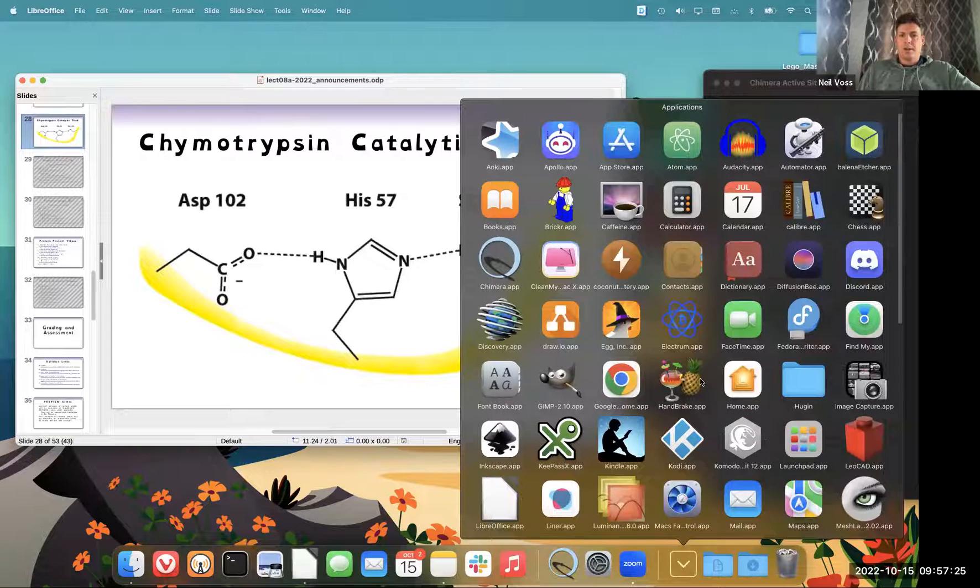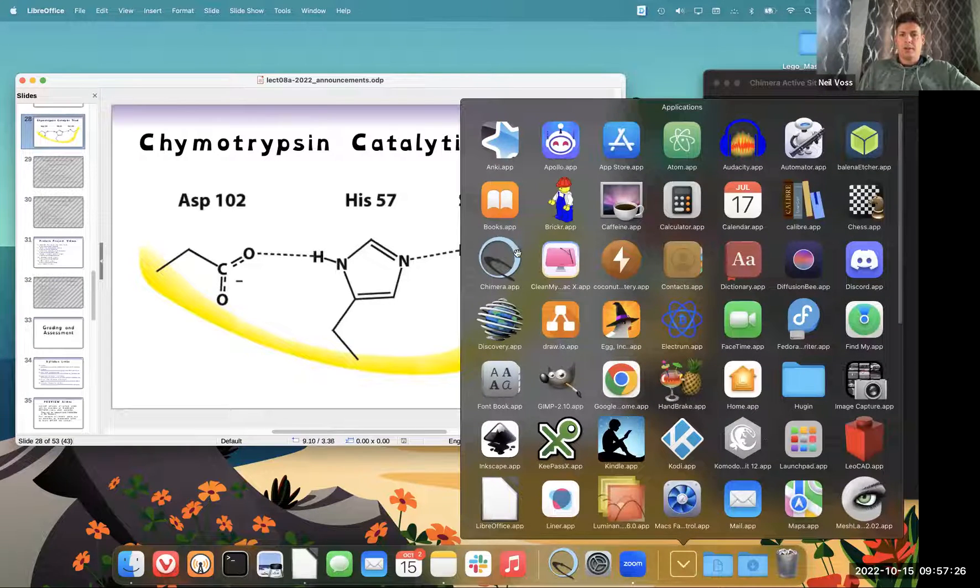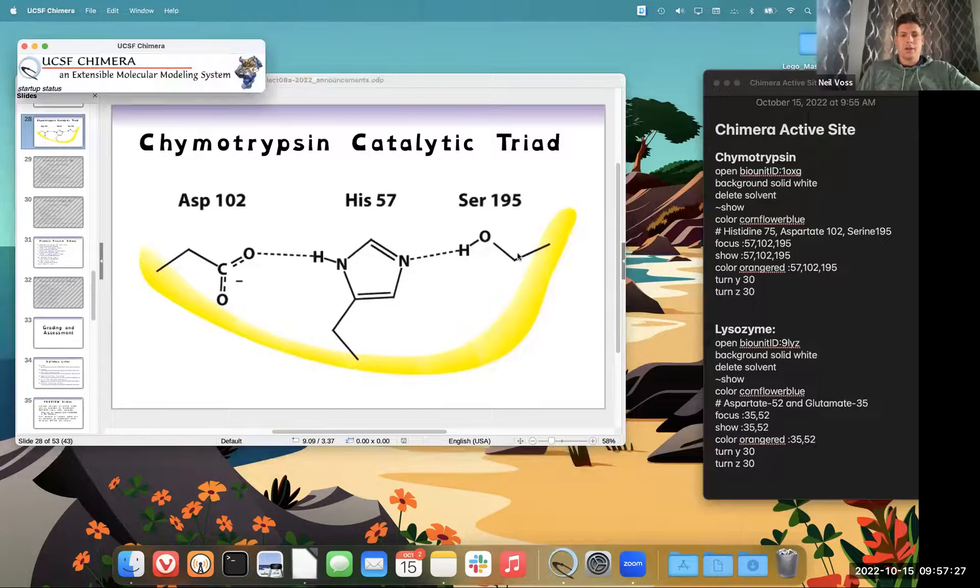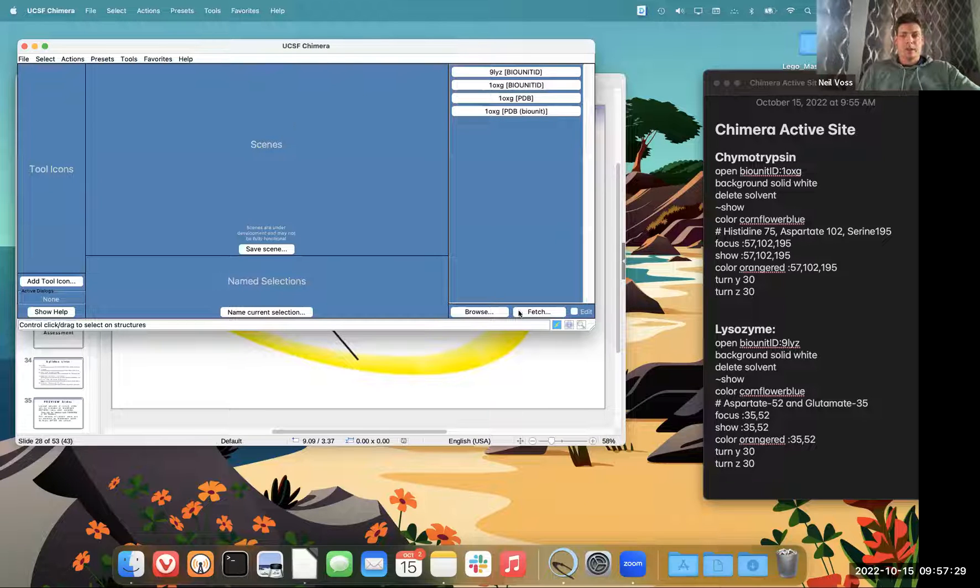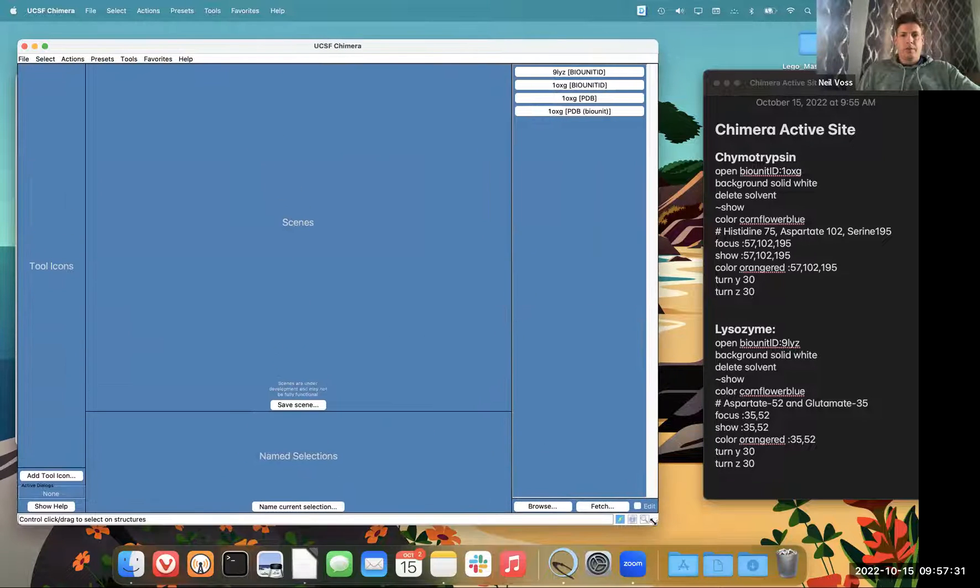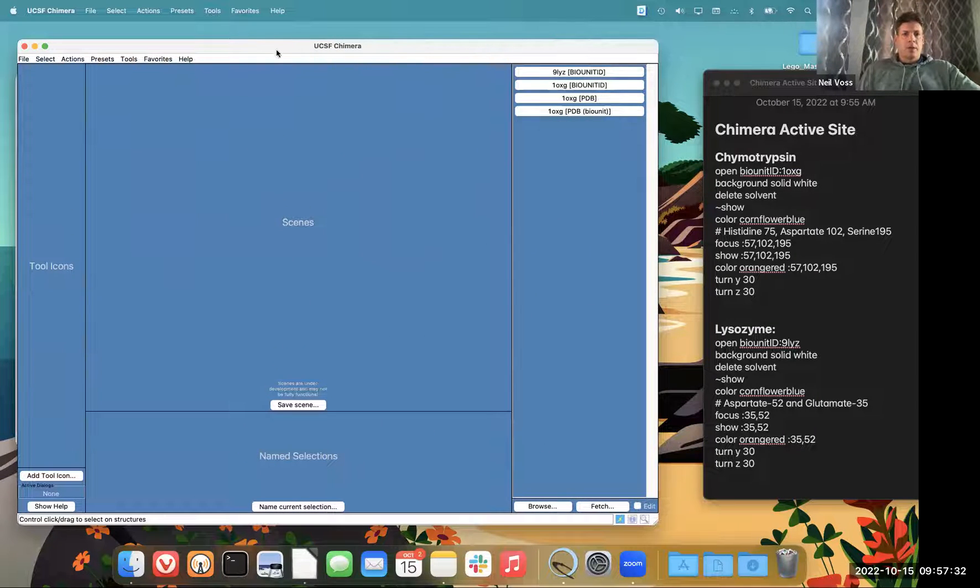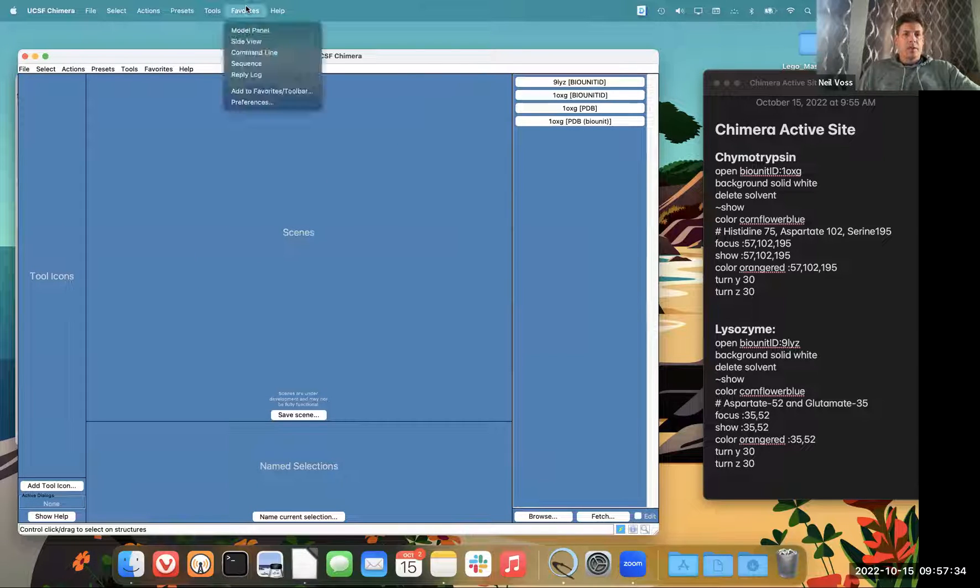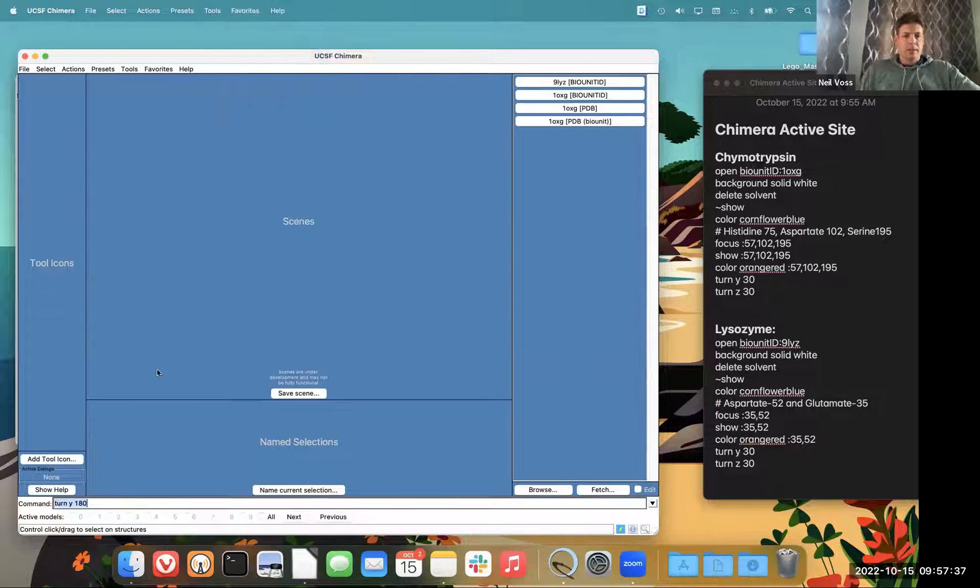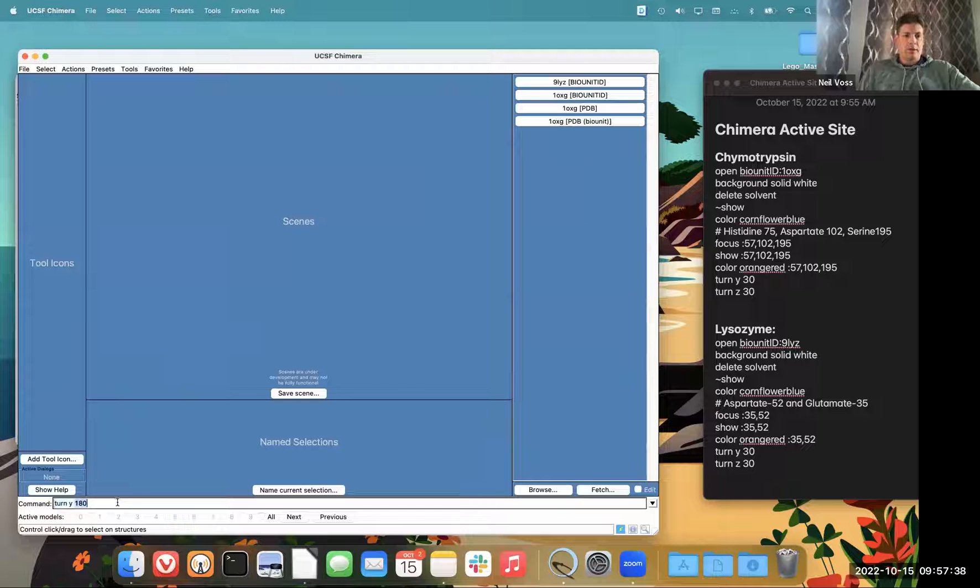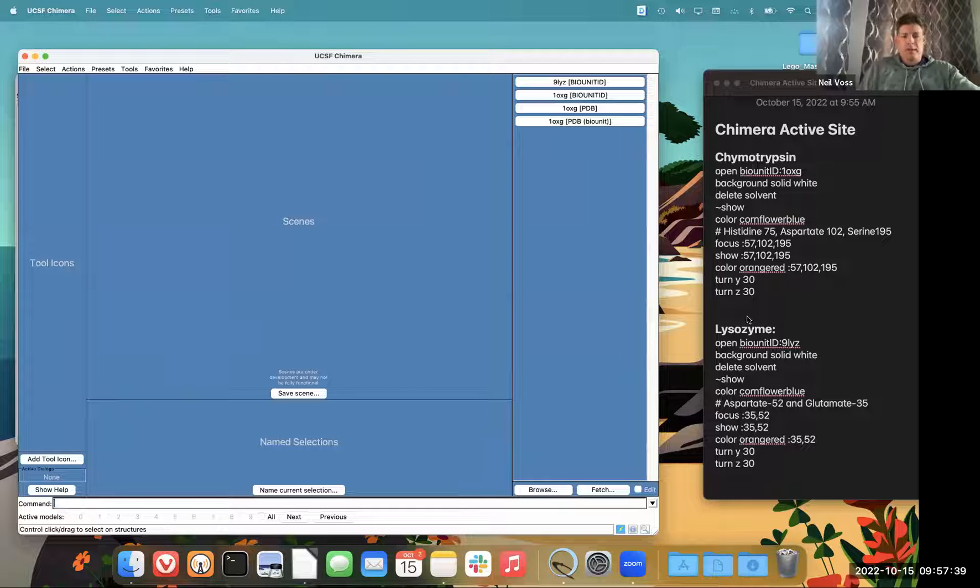It does require use of this thing called the command line, which I am a huge fan of. So first thing you need to do is go under favorites and select command line. And now I have this fancy dancing thing down here.